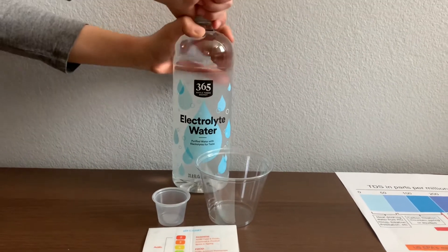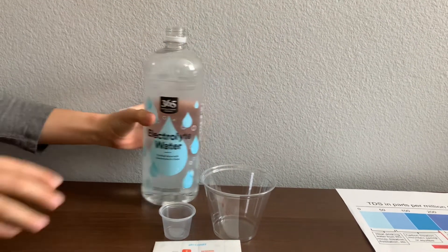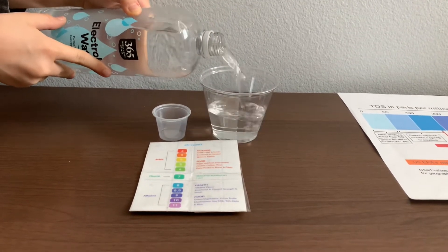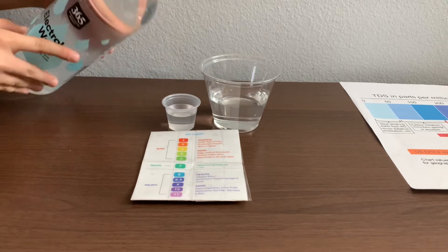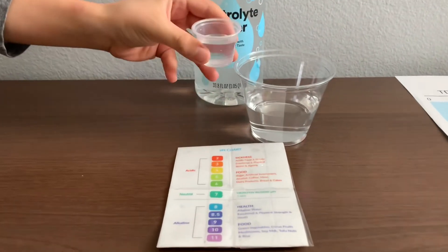Let's test the pH and TDS levels. Let's pour some water in. That's a little too much for the pH cup — let's pour some back into the TDS.